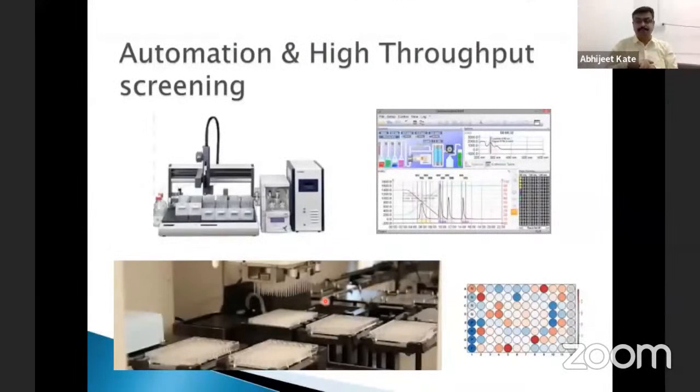That is why the microbes are very important. Now these are some of the machines that I have used during my research, and they are really automated, and that's why you can speed up the process. You could do this job in 2-3 days because of these tools. Here I'm showing you one of the liquid handlers, which can inject the sample onto the column, and then you can collect the fractions and put them in an evaporator, which can dry them for you.